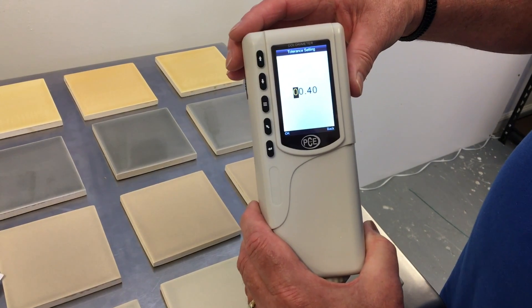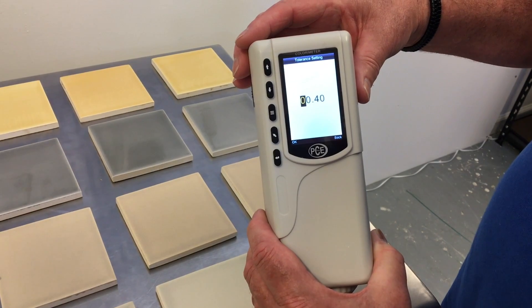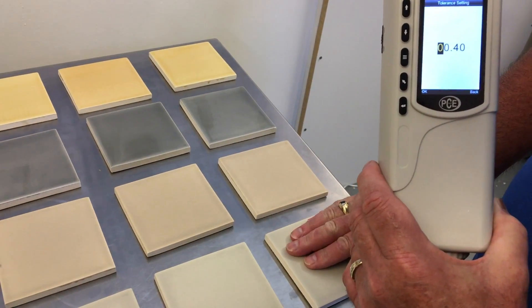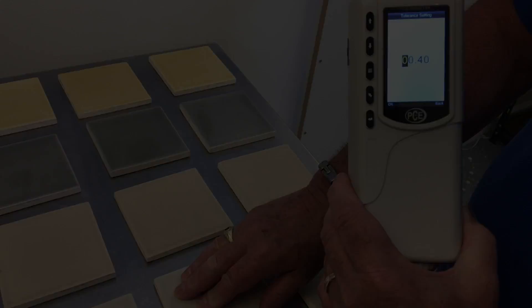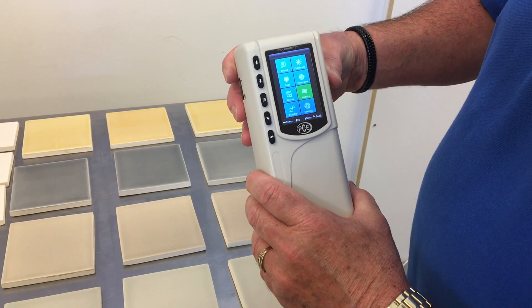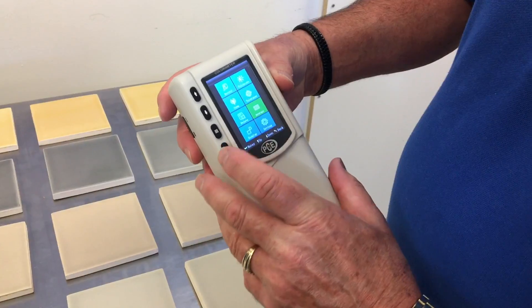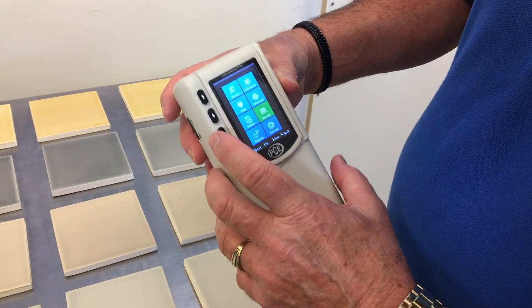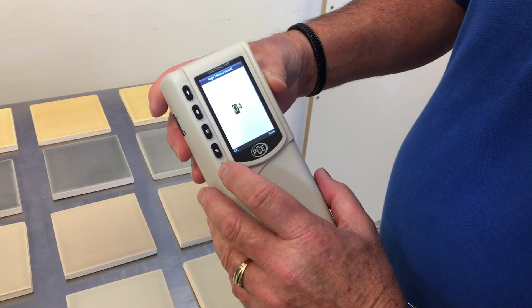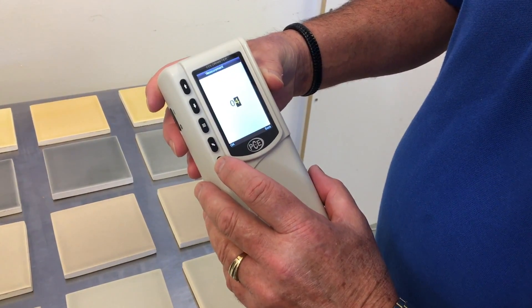The tolerance value is set by the user and depends on the amount of deviation that the user wants to allow between the reference and the sample. We are going to set the number of measurements we are taking on the sample. To do that, we go into the menu and to average. Enter. It's set at zero — we'll set it to four. So four times on each sample.